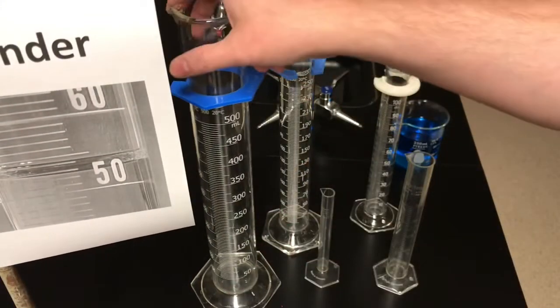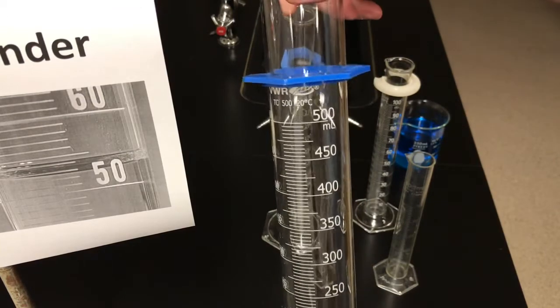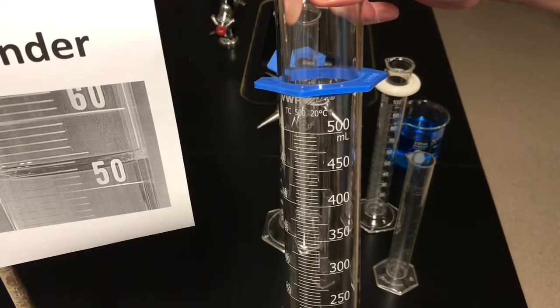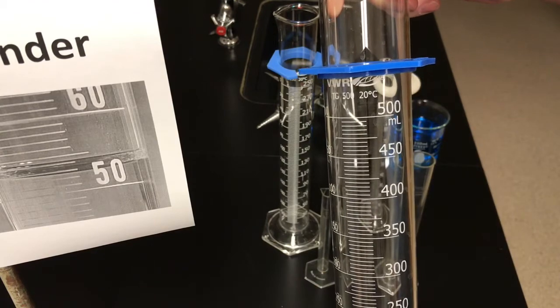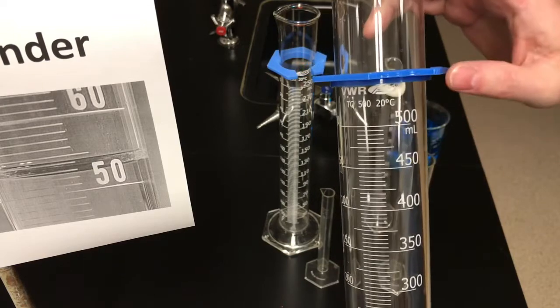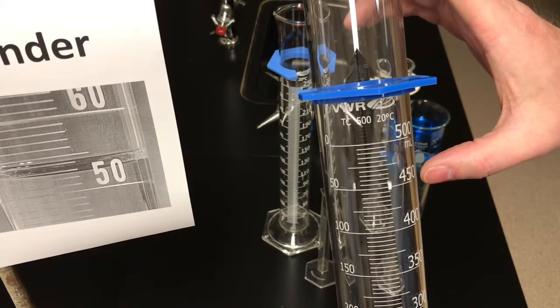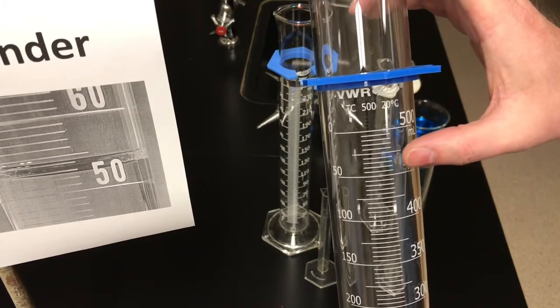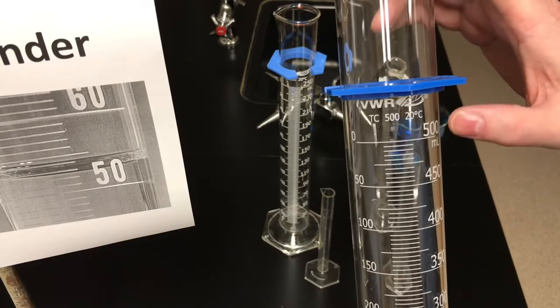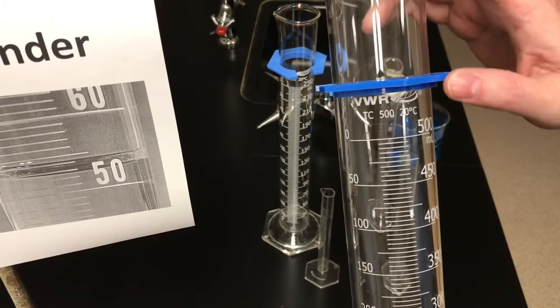Here's a large graduated cylinder that you probably won't use much in the lab, but our lab assistant uses it to prepare solutions for us. It's a 500 mL graduated cylinder. The numbers go 400 to 450 to 500, so the major scale would be 50 milliliters. Then between 450 and 500 there are 10 spaces, so you take the major scale of 50 and divide by 10, giving a minor scale of 5 milliliters. Each of those little tick marks represents 5 milliliters.